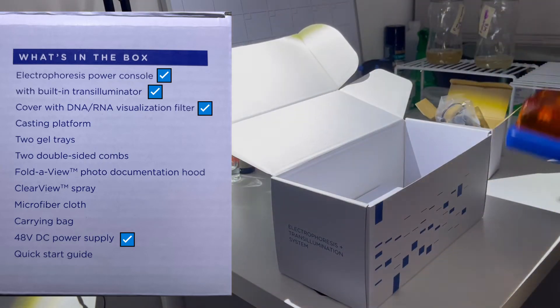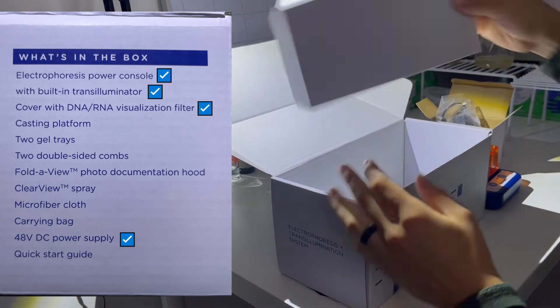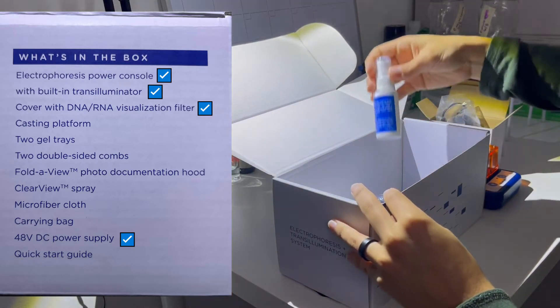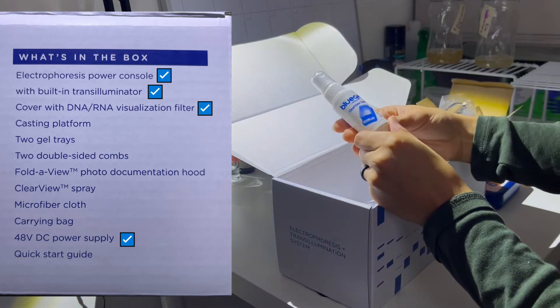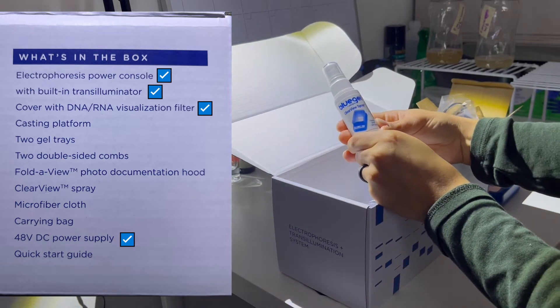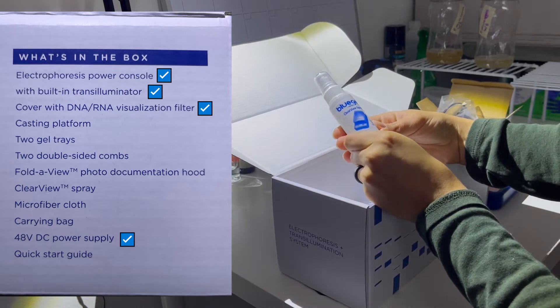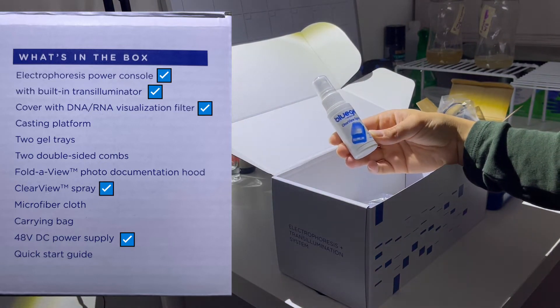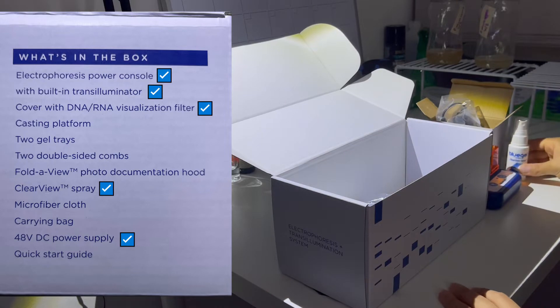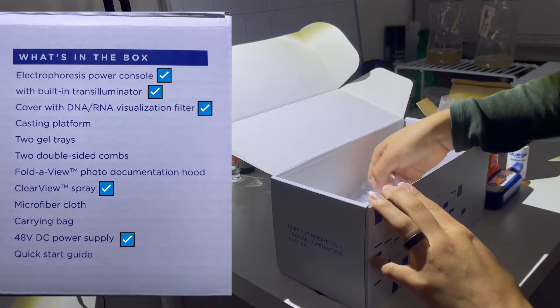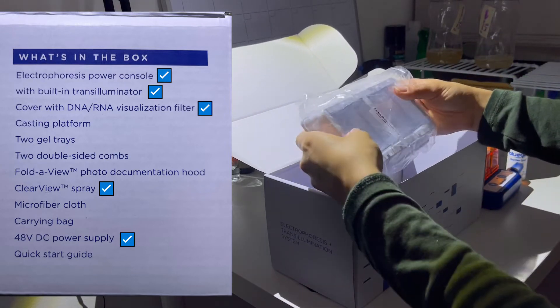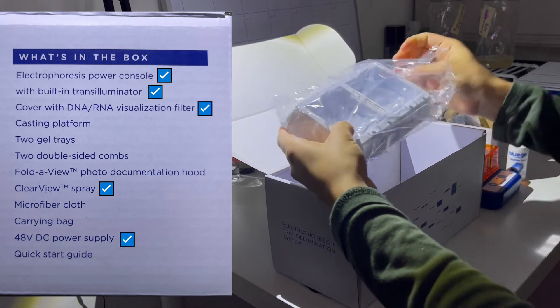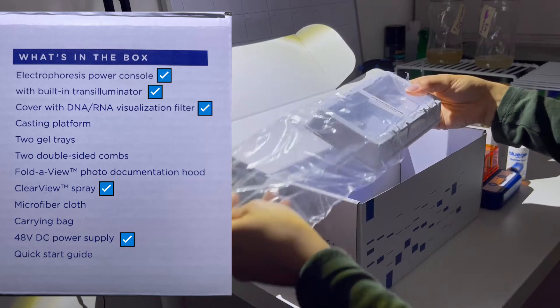I like it. What's next? More packaging, and a spray bottle. I'm guessing this is the ClearView spray that you put on the orange covering. And here is the casting tray or casting platform.